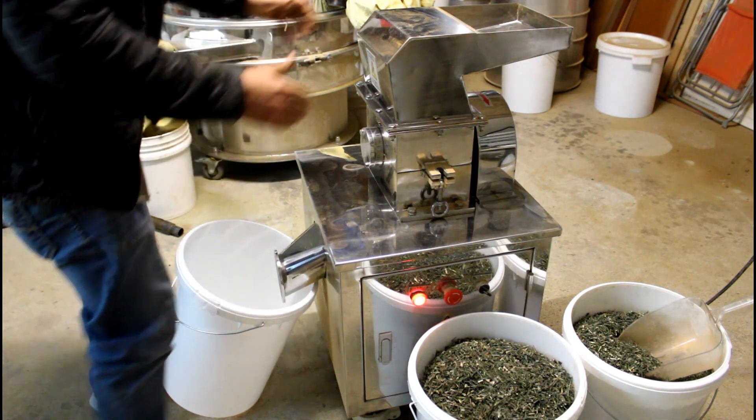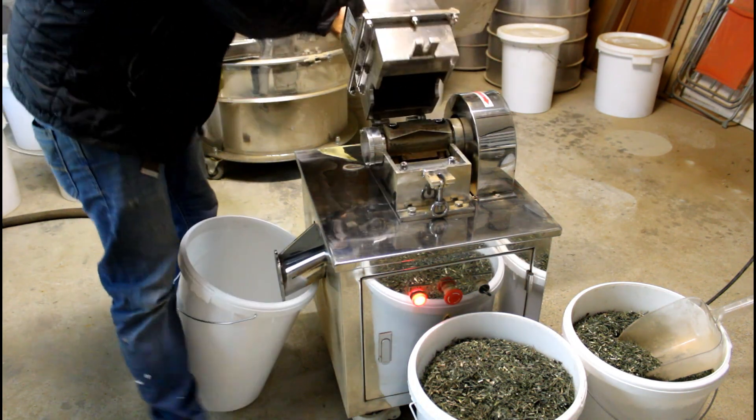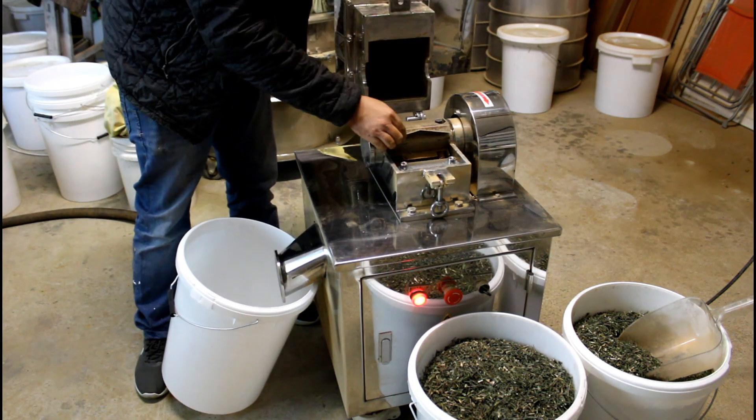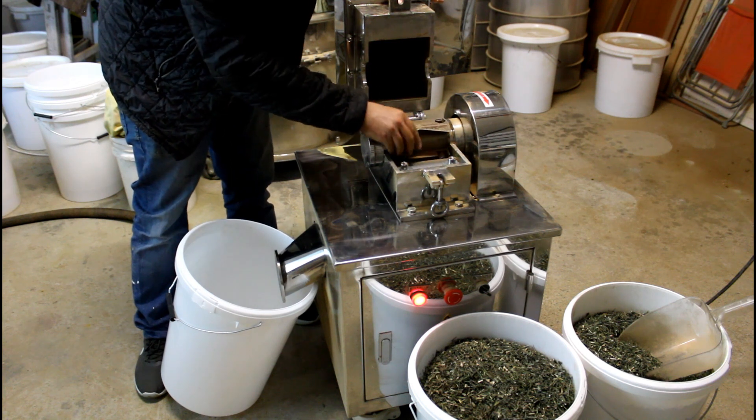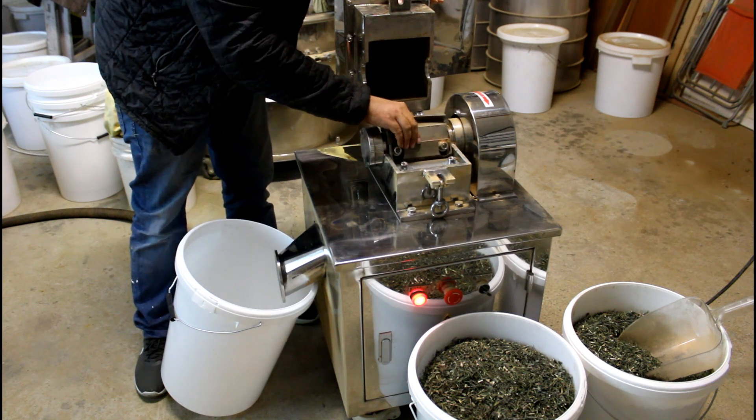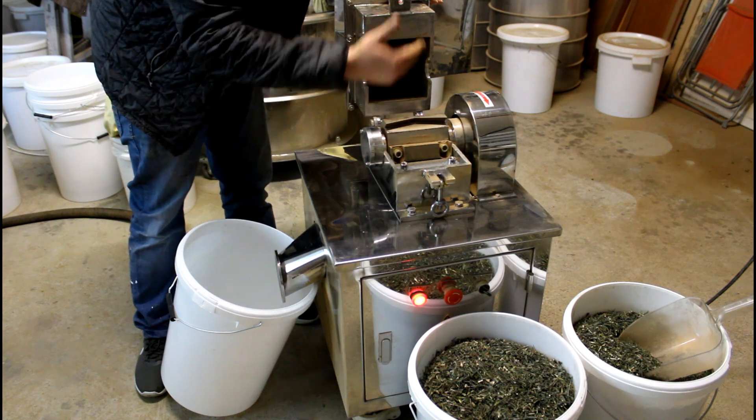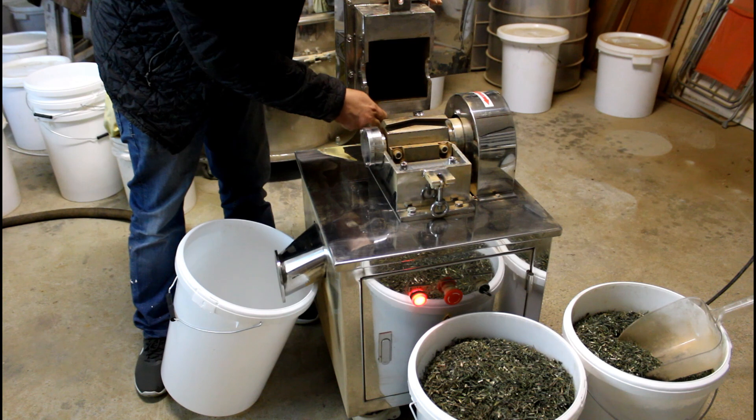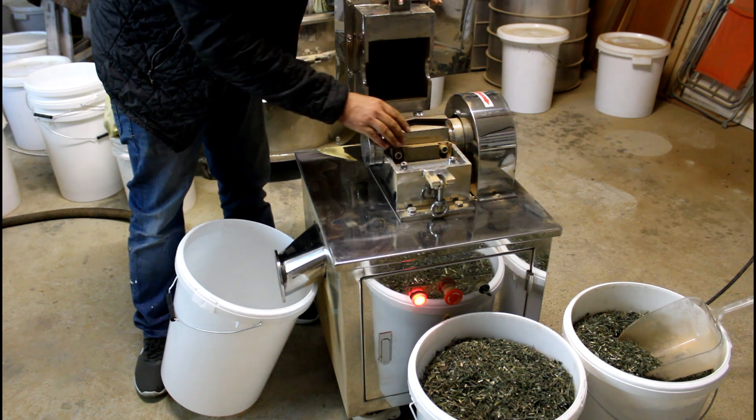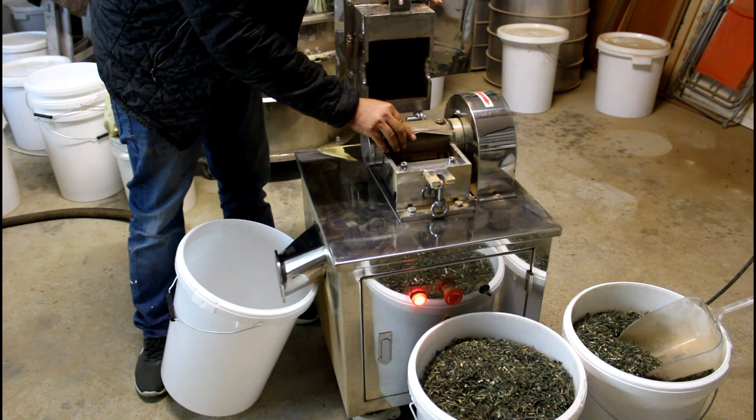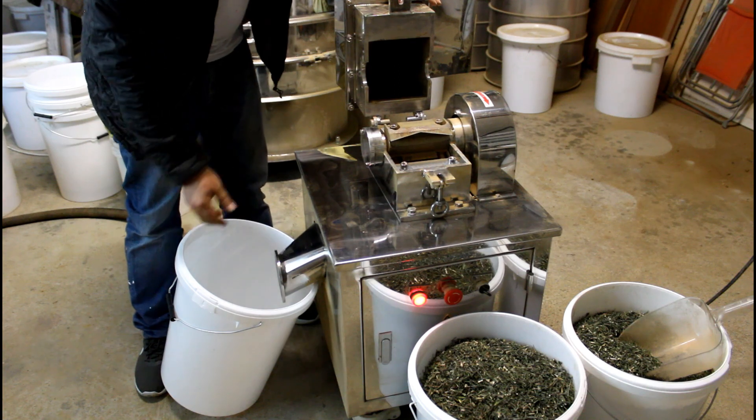Let's have a look inside the coarse mill. Here you see that there are some rotating plates. And these rotating plates are chopping up whatever is filled into the mill. And some holes where the chopped up stuff is falling through and it's running out here.